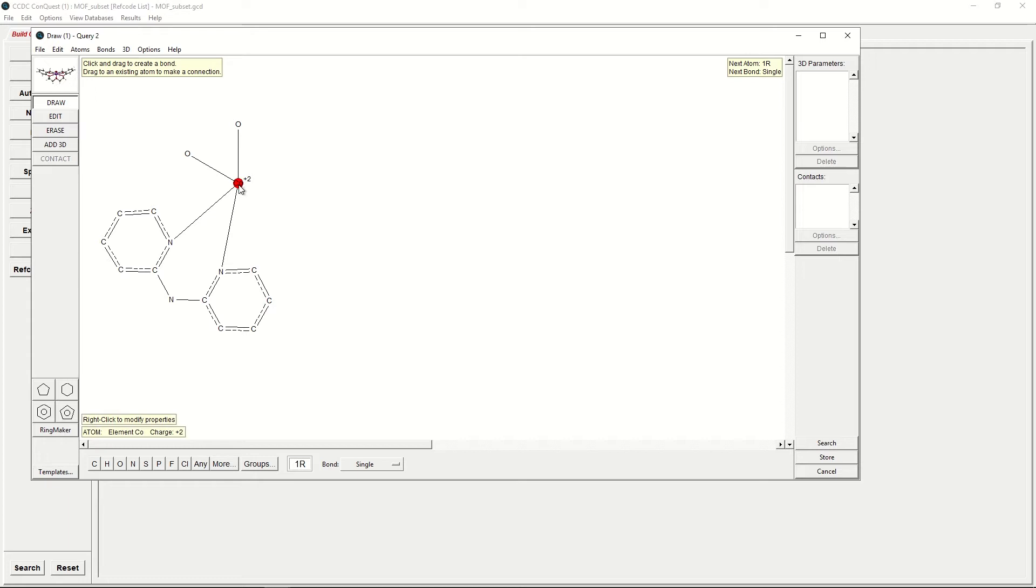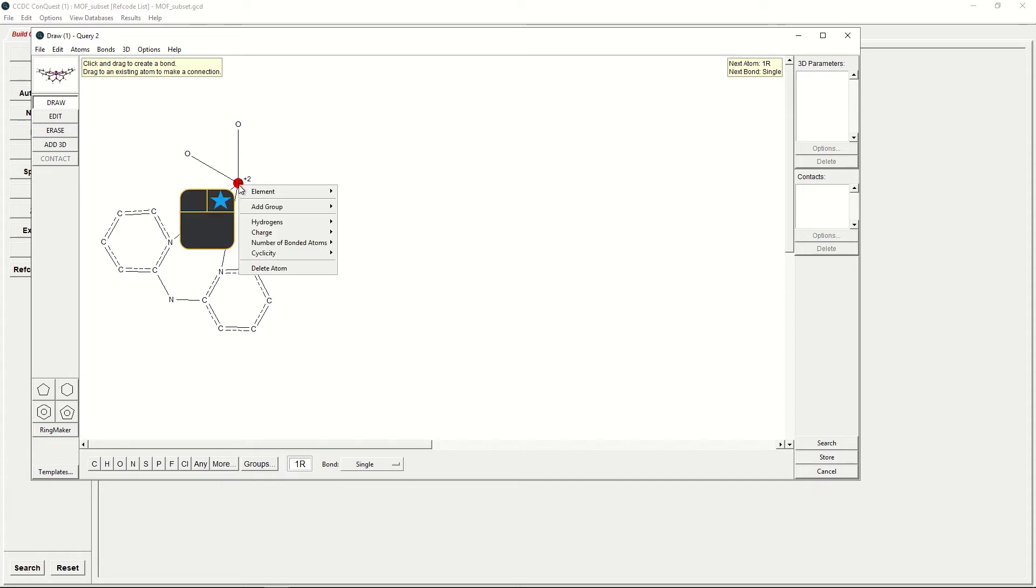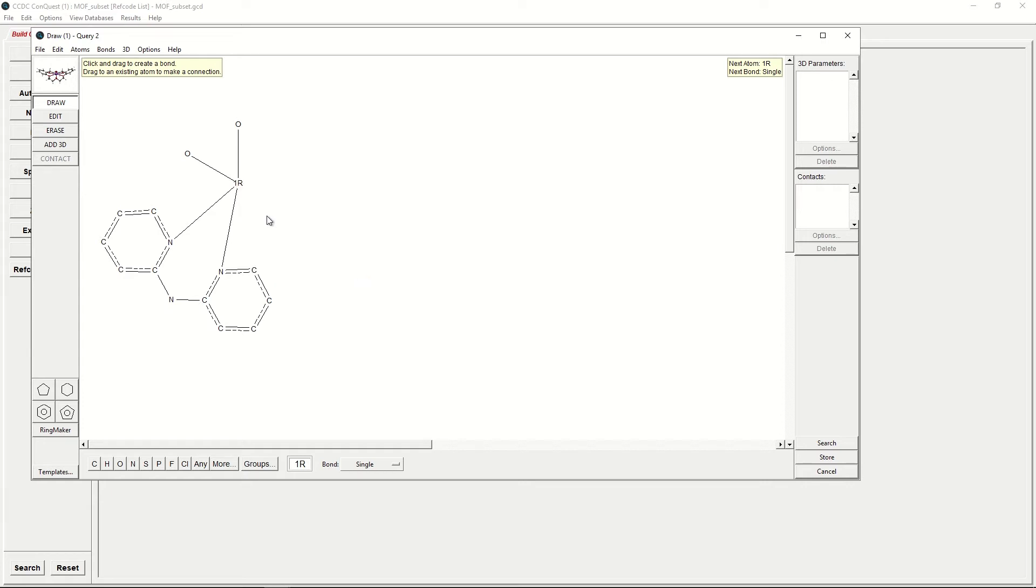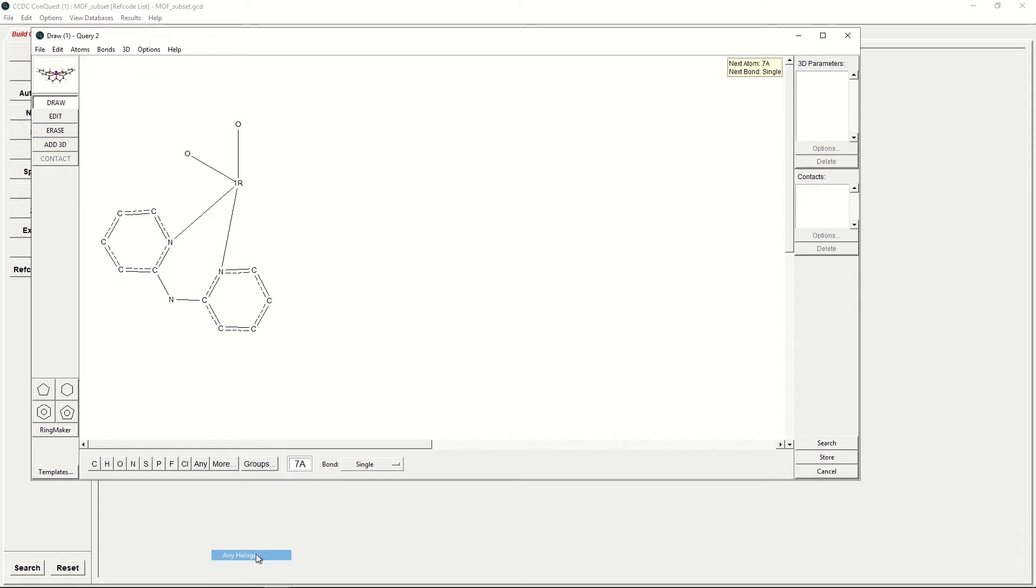Click on the Cobalt Centre, change it to any first-row transition metal represented by 1R. We can change the charge to unspecified by right-clicking Charge and clicking Unspecified. Finally, we would like to change one of these oxygens to any halogen. To do this, we will click More, Any Halogen, click on one of the oxygens, which will change it to 7A, which represents any halogen.